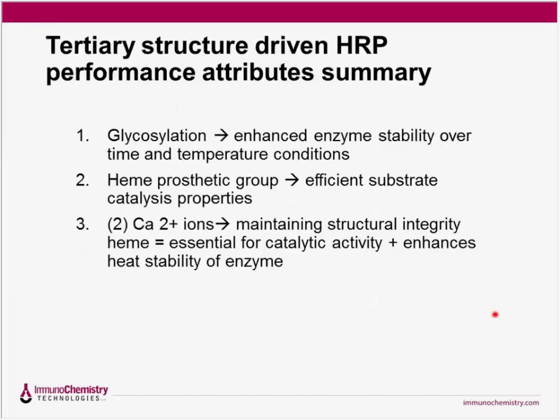So of the 3 structures that I mentioned in today's webinar, glycosylation is responsible for stabilizing the enzyme over time, as well as allowing it to work at elevated temperature conditions. When you remove the carbohydrate, it is not as stable to performing at higher temperatures.